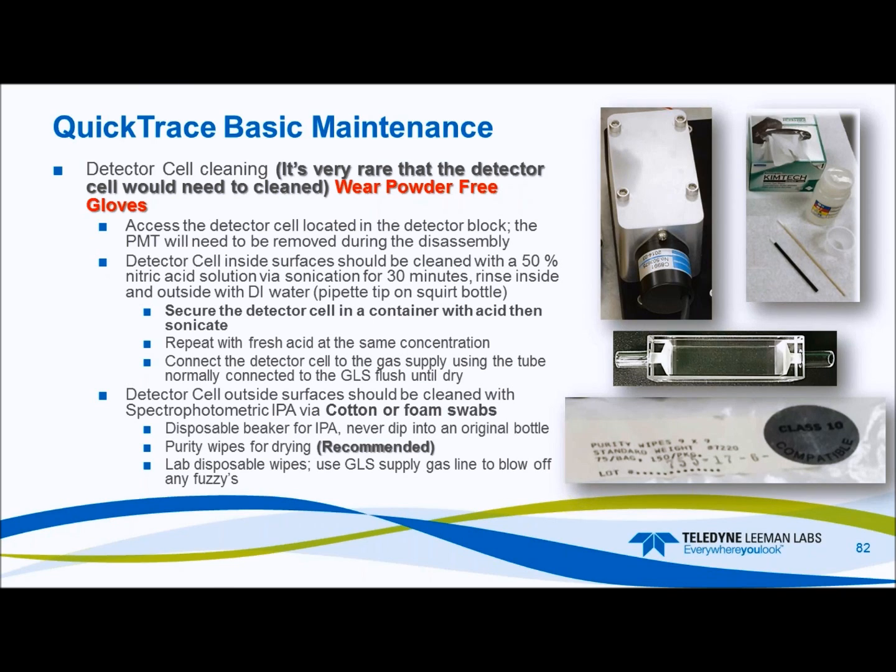And then connect it to the supply gas on the front of the instrument by the GLS, and you can dry the inside. And then the outside you need to clean. And we use IPA, cotton swabs or foam swabs. Never dip into the bottle.